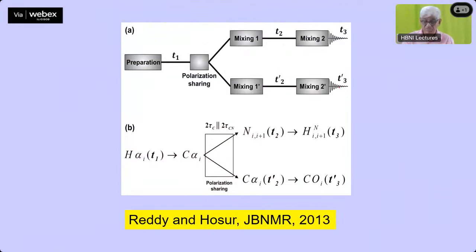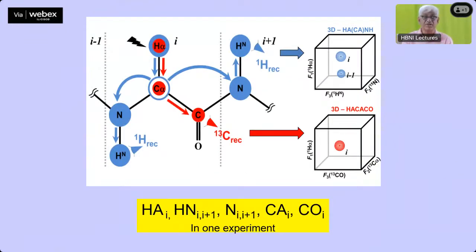Okay, these belong to the same residue and these ones go sequential to I and I plus 1. Schematically, this spectrum is shown here. So you start from the H alpha, go to the C alpha, part of it is transferred here, and part goes here, part remains there. What remains there is then transferred to the carbonyl. You detect the carbonyl spectrum here. So this is the second receiver here, which is the carbonyl detection.